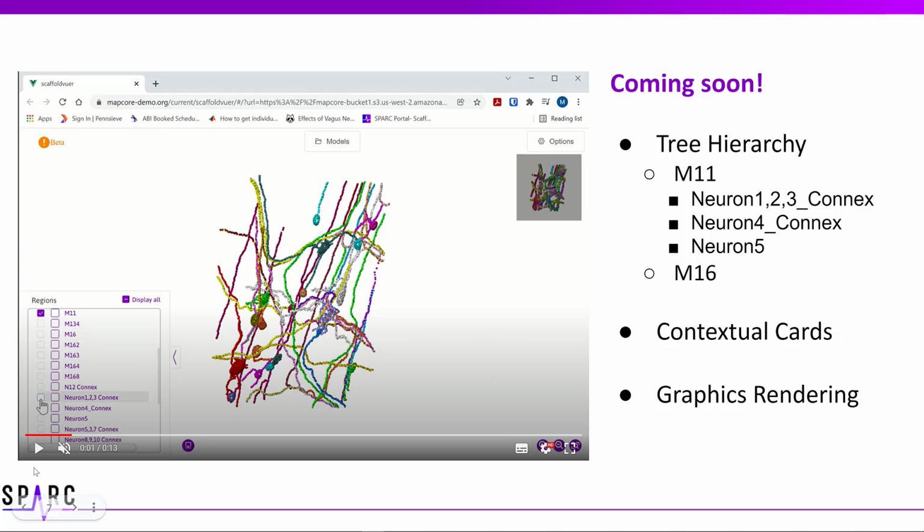This dataset depicts individual neural wiring patterns in enteric microcircuits and aims to showcase how neuronal soma and fibers in a myenteric ganglion interact. To achieve this aim, the investigator has created individual groups of interesting neurons.